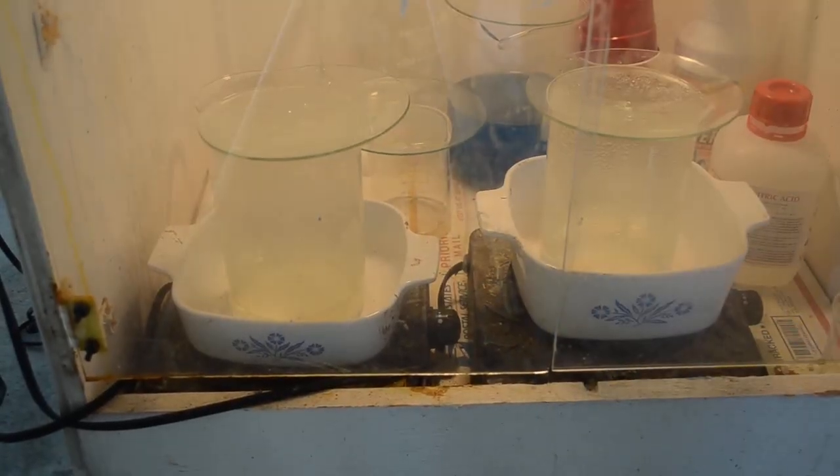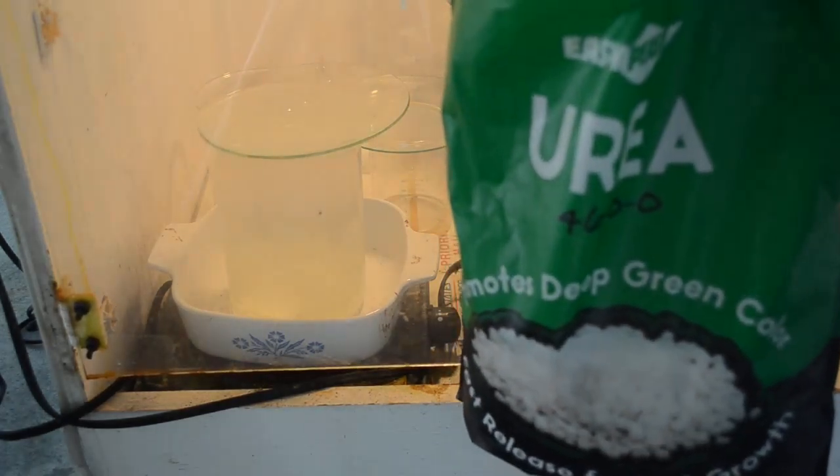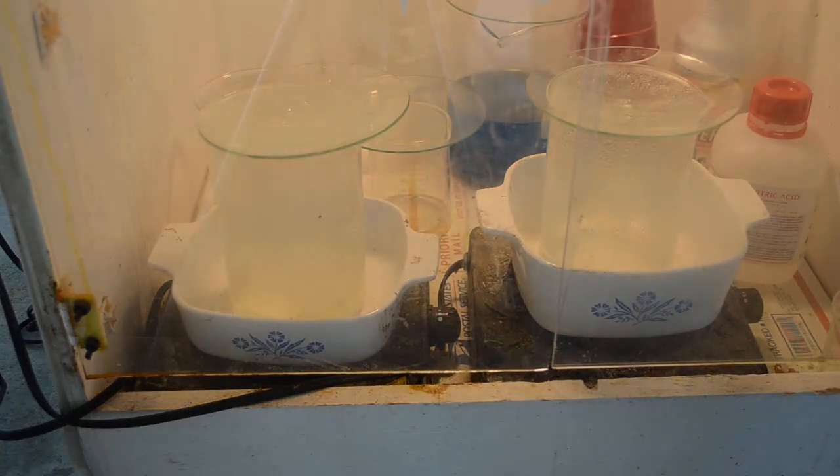I don't use urea generally except as a last resort. Sometimes you've got a solution that just doesn't want to denox and you can't get the gold to drop no matter what you do. I'll add more sulfamic acid, and dilution helps too — if the pH is really low, just diluting with pH-7 water can bring it up enough to drop the gold better. But if nothing else works, I'll reach for the urea, because urea not only neutralizes the nitric acid but also raises the pH of the solution since it's somewhat basic. That makes urea doubly good as a last resort: it destroys the nitric acid and raises pH to help drop the gold.